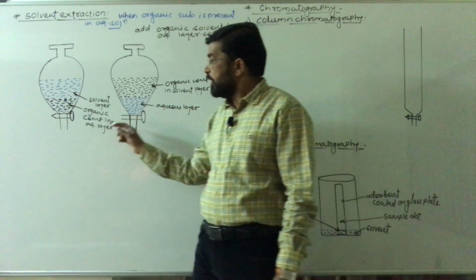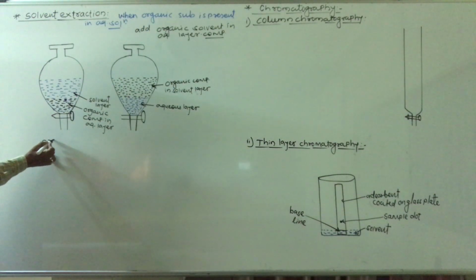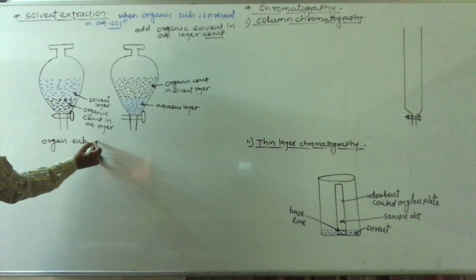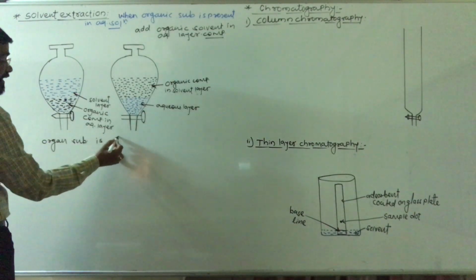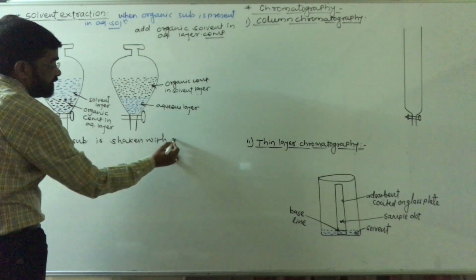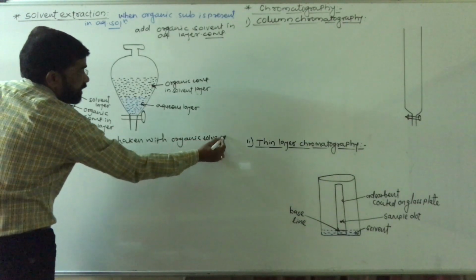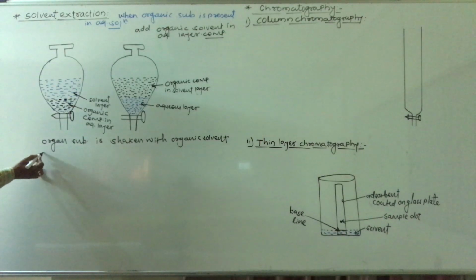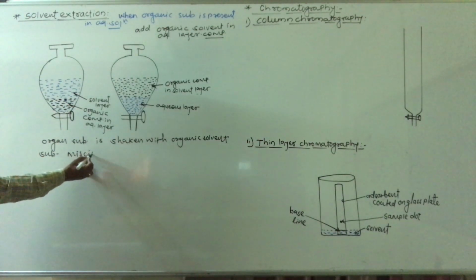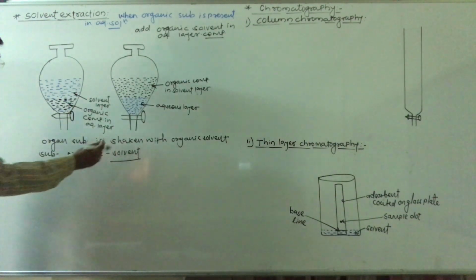Okay. When it is vigorously shaken with the organic solvent, then the organic substance is now miscible in that organic solvent from the water.